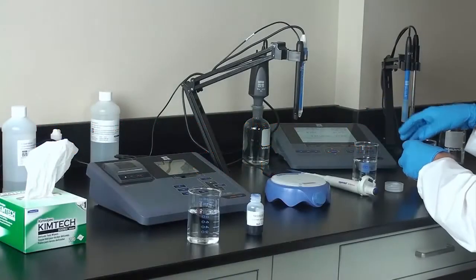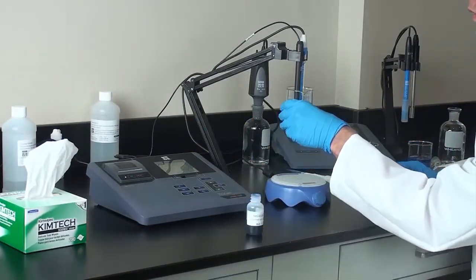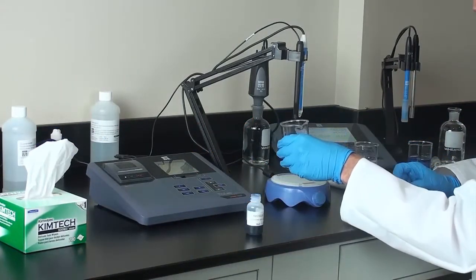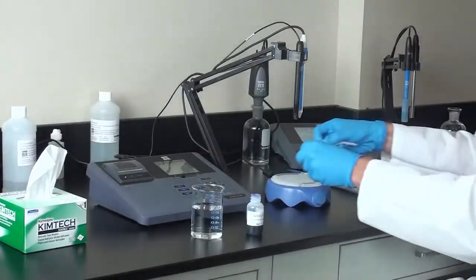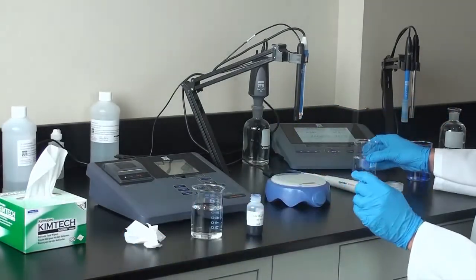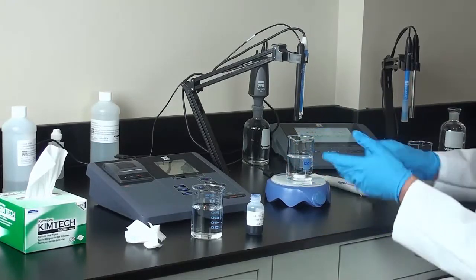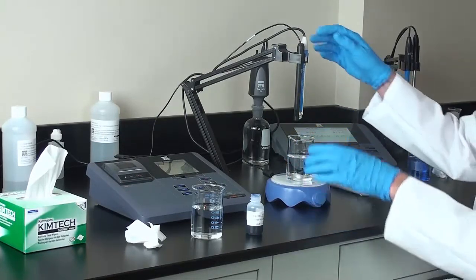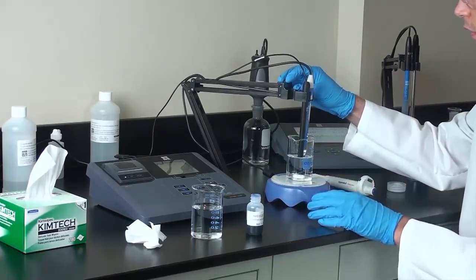Our second point is 100 mg per liter. You want to make sure that you rinse your electrode off before placing it in the next solution. Then just like before, we will place our next standard on the stir plate. So this standard is 100 mg per liter. We will put the electrodes in solution here.